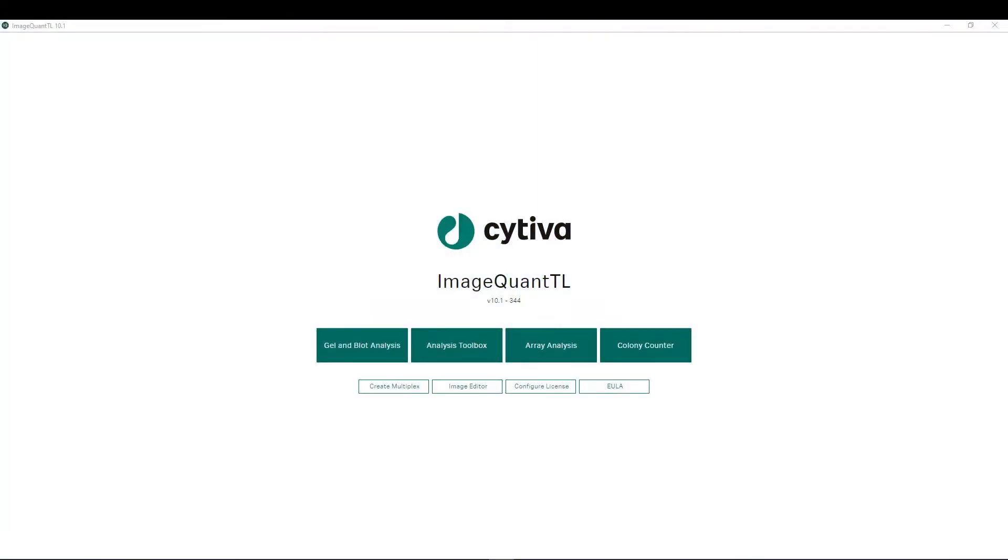Hi and welcome to the ImageQuantTL version 10 tutorial video series. In this introduction video we will be providing an overview of the ImageQuantTL version 10 software, highlighting such things as the updated user interface as well as additional functionalities such as lane comparison and different options for normalization.